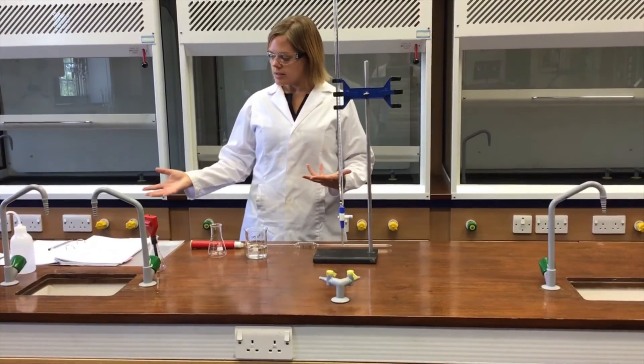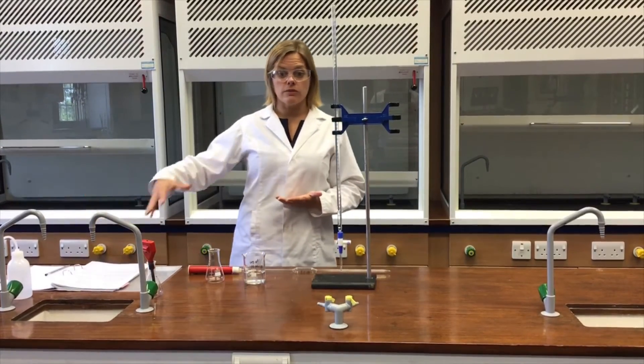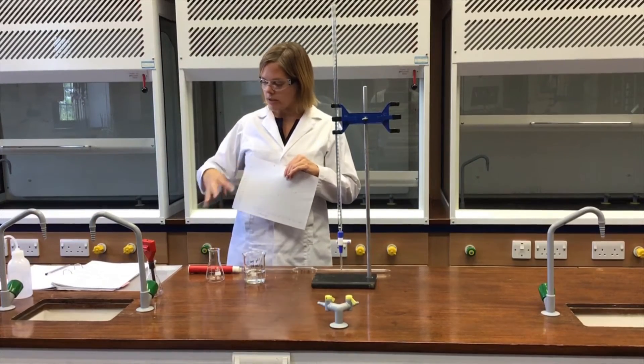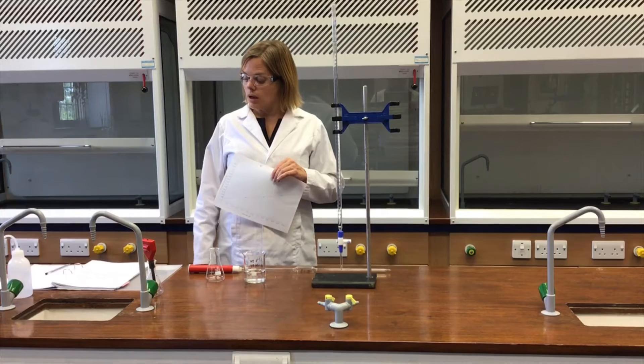Now that I've taken all the data from adding sodium hydroxide solution to ethanoic acid solution, I've filled it in on the table. Once I've finished the practical work I can use this calibration graph to transfer those readings back to true pH data, and then start to analyse that data appropriately.